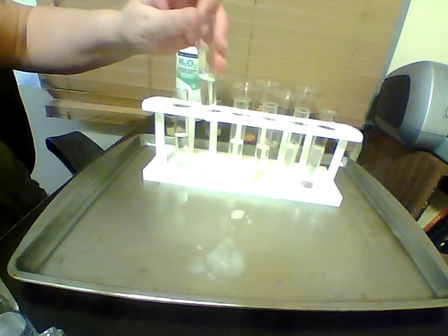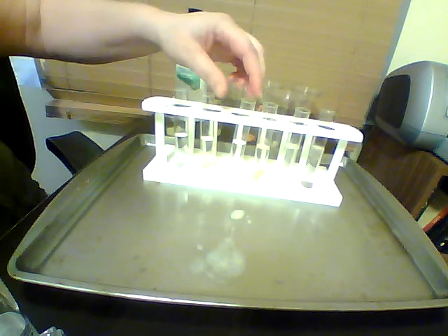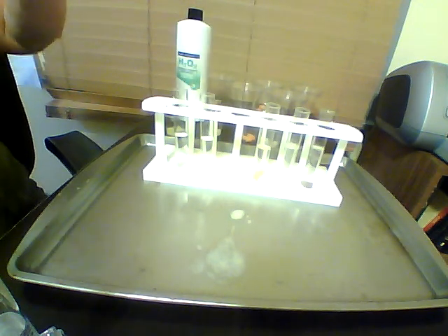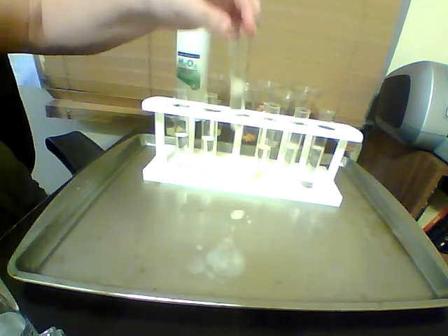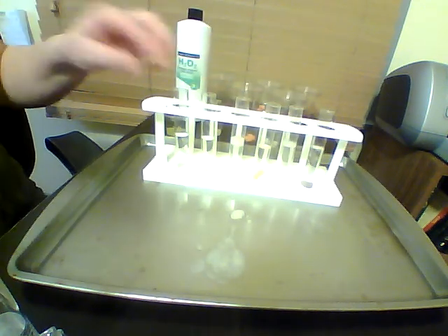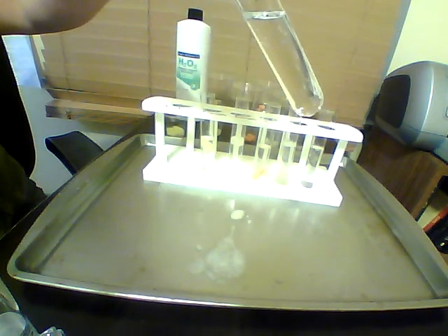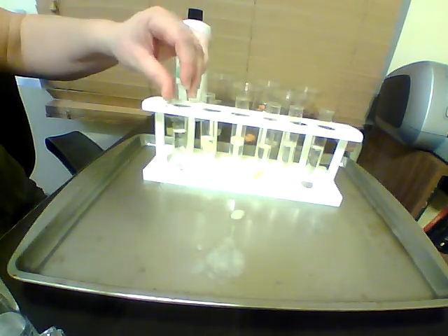Looks like this didn't make it all the way in. Stir, get them down in there. Yeah, I didn't get it all. There we go. Okay, so we can see some reactions. This is our control again. Very little bubbles.